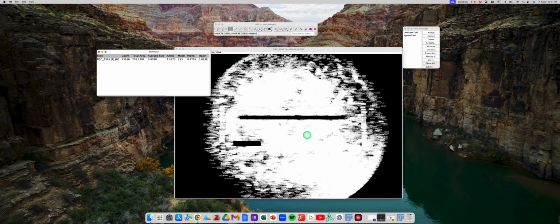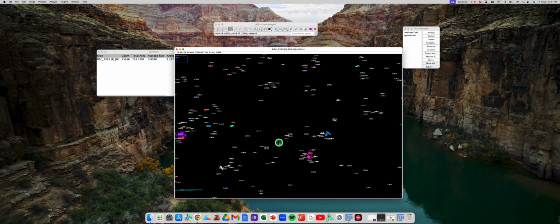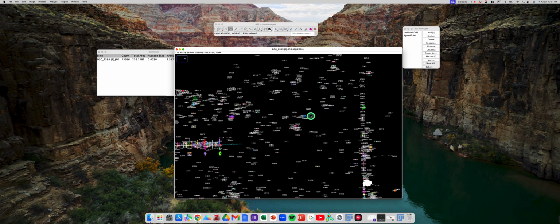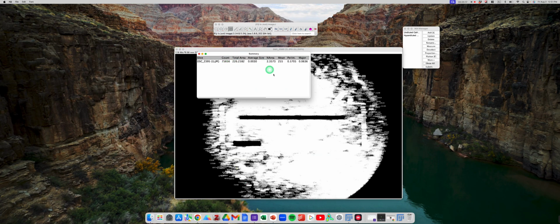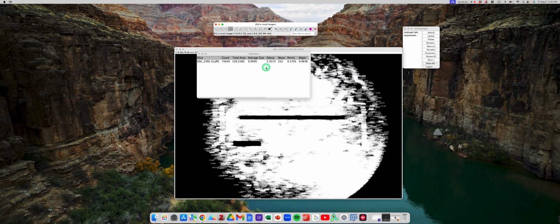And it's good to spot check this again. So zoom in. This is now obviously a massive file. And so I think 0.004 highlighted some noise. So really I would stick with 0.005 as the threshold. But that is it. There's the summary data. Here's all of the individual results. And that is how you do it. That is it.